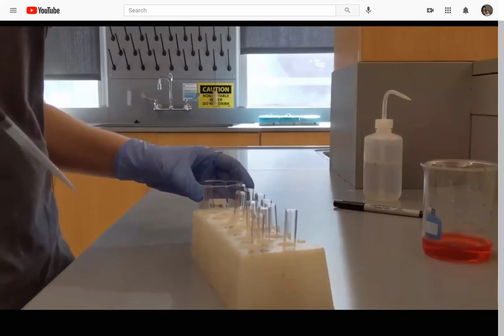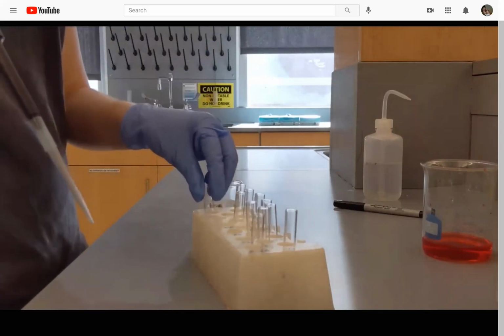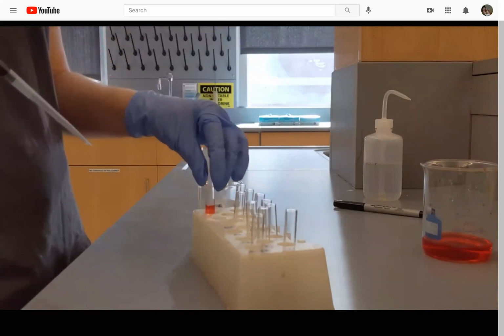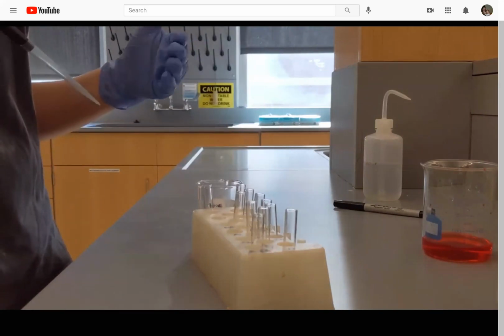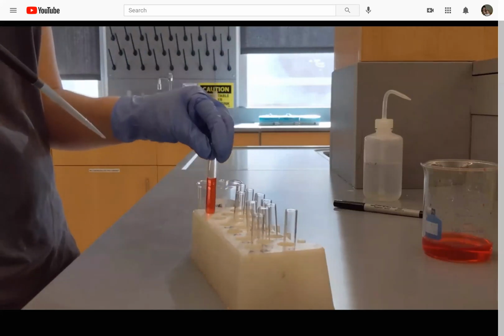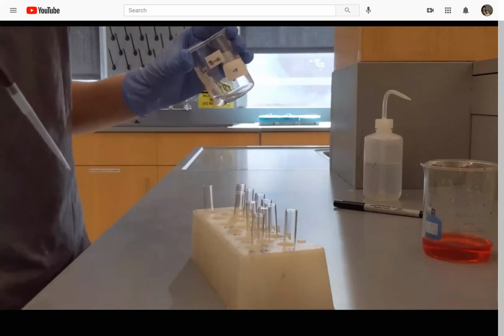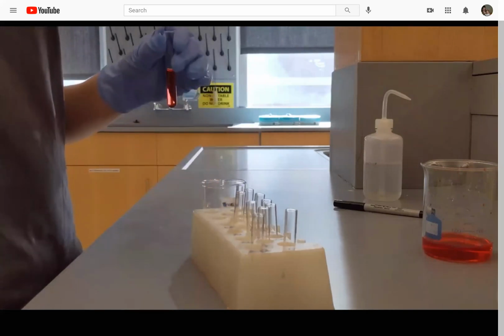All right, so I'm now moving on to the second part of the lab where we're going to make a 1 to 10 dilution of a solution with an unknown concentration of the same red dye that we just tested in our standards. So I've made the calculation of how much water I need to dilute 9 parts water to 1 part unknown solution. And I'm simply going to use M1V1 equals M2V2 to make that calculation. So I've gone ahead and done that for the sake of time. And I know I need 3.6 milliliters of water for 0.4 milliliters of my unknown solution.